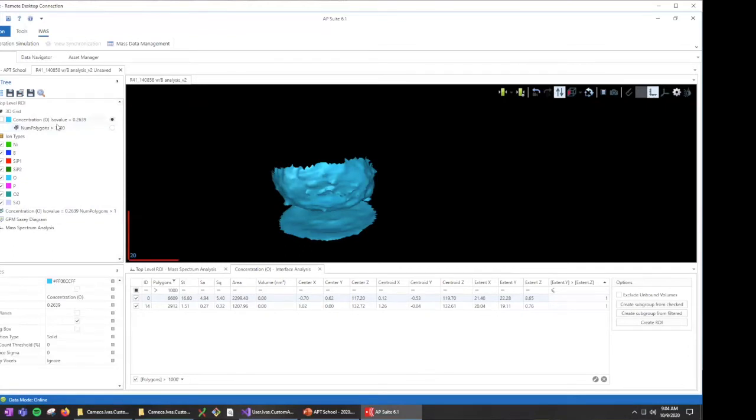So hopefully that is clear. When you have surfaces up here, they're algorithmically generated and they're saved that way with the analysis. If you detach them, now it's saving the triangles with the analysis set, and nothing you do up here will change the surfaces that are detached.